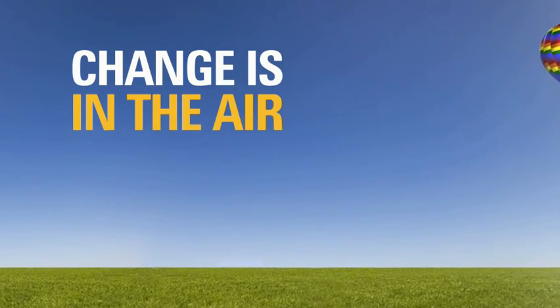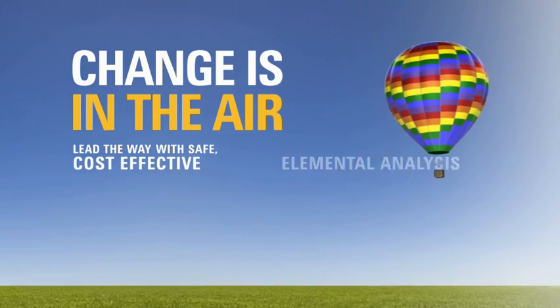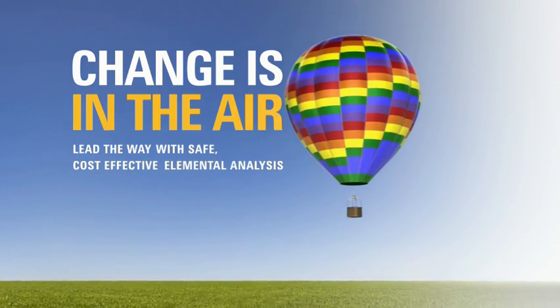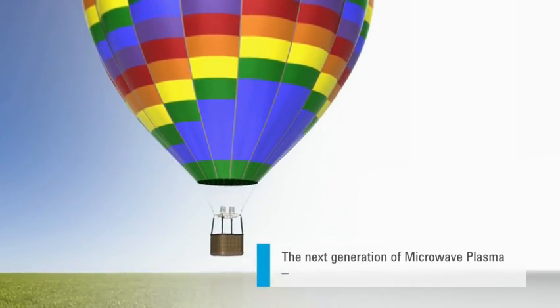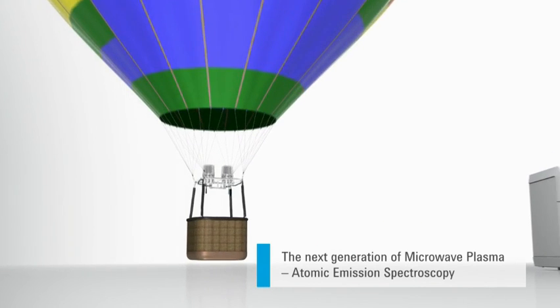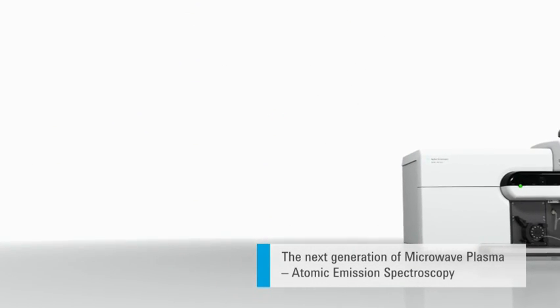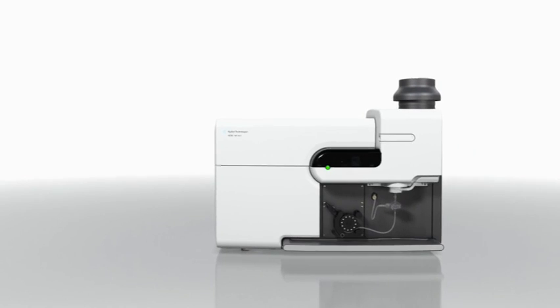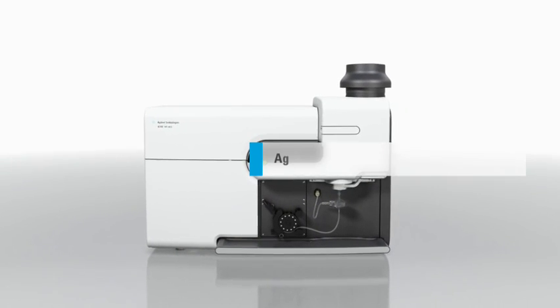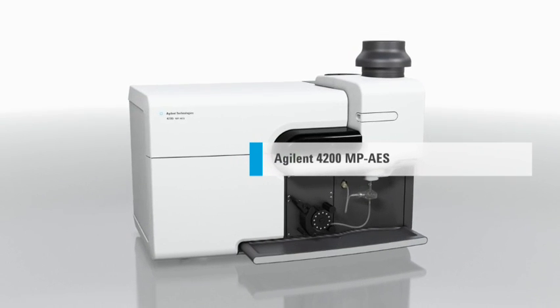Change is in the air. Lead the way with safe, cost-effective elemental analysis. Introducing the next generation of MPAES technology — it's changing the way you work. Introducing the new Agilent 4200 MPAES.